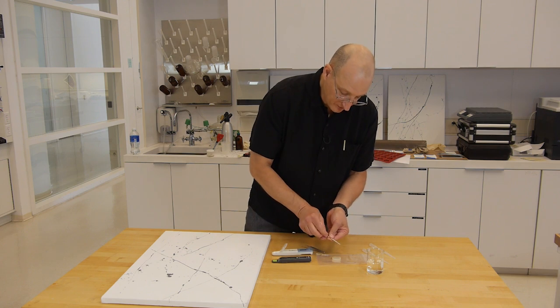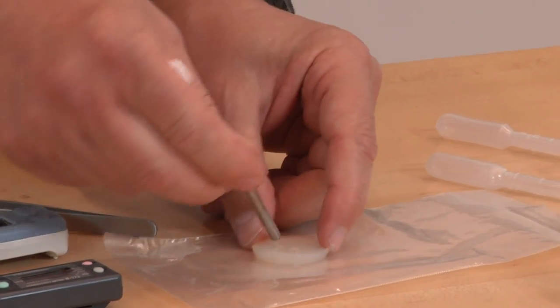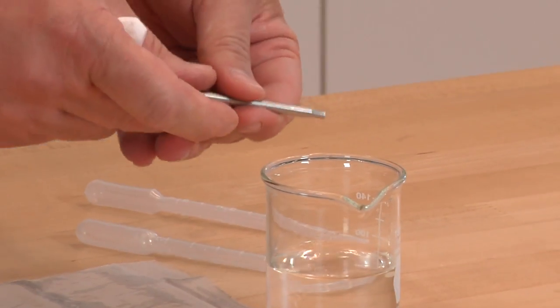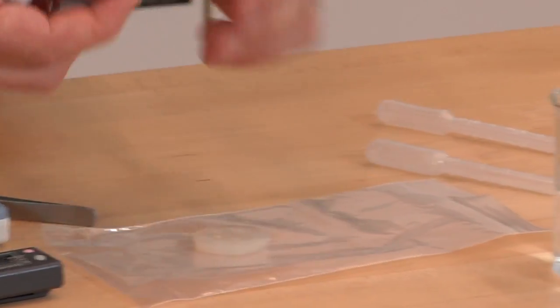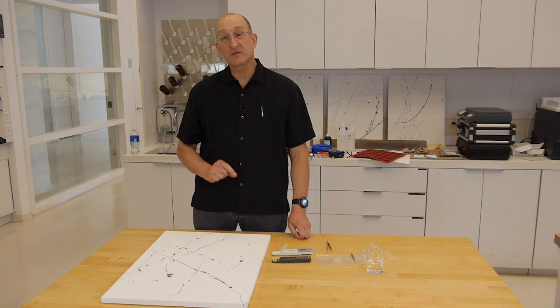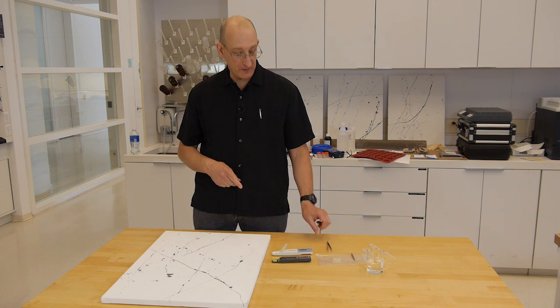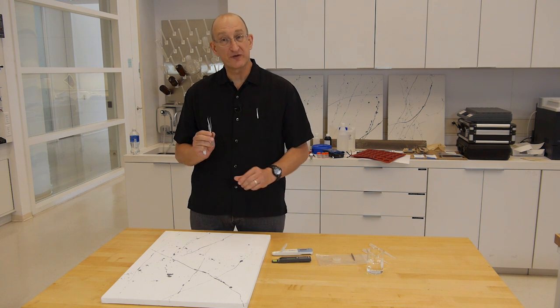Because there is the preservative in this, we want to soak it in distilled water for a few minutes so that we can rinse the preservative out. We don't want to handle the plugs with our fingers because the salt on our fingertips will add to the conductivity we measure. So we always use a pair of tweezers to handle them.